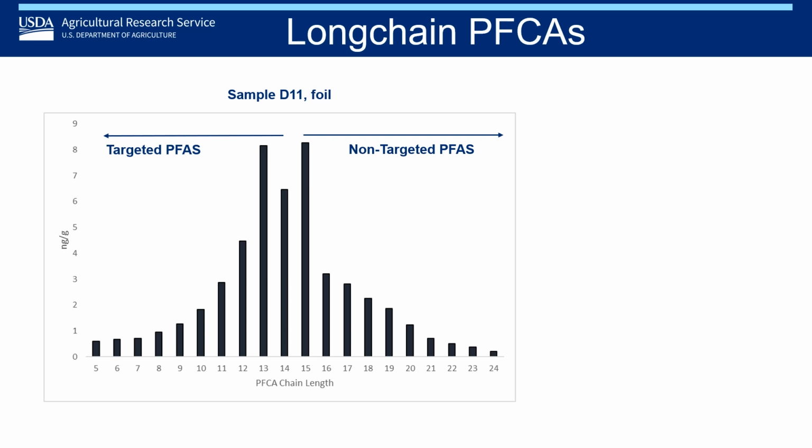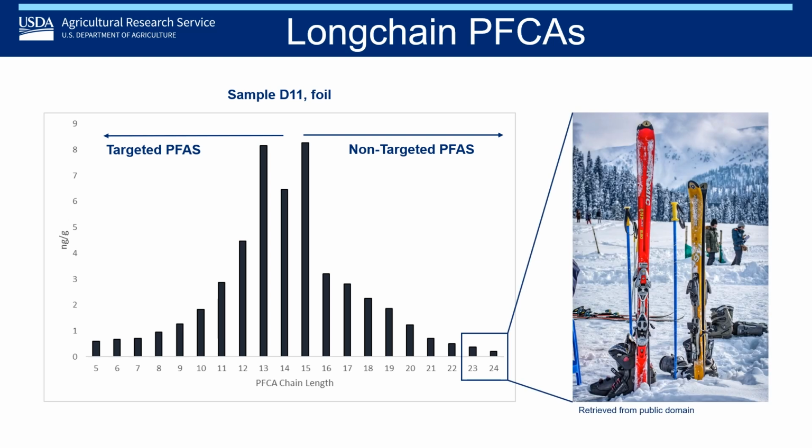So this was a really interesting finding and a really interesting use of not just looking for the compounds that you see in your output, but also thinking chemically, thinking with your organic chemistry background about what else might be related to that, and using that knowledge to extend your reach to look for more compounds.